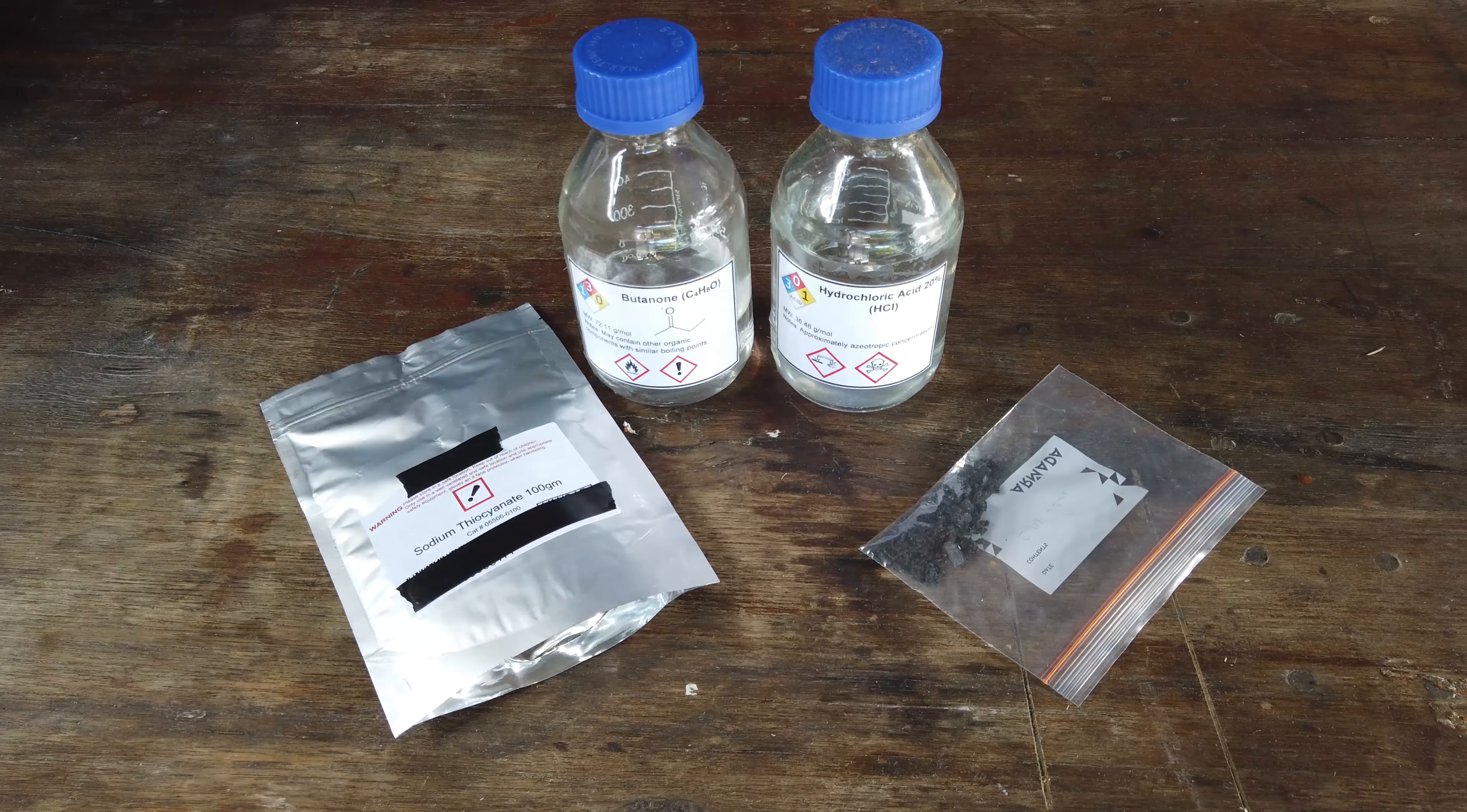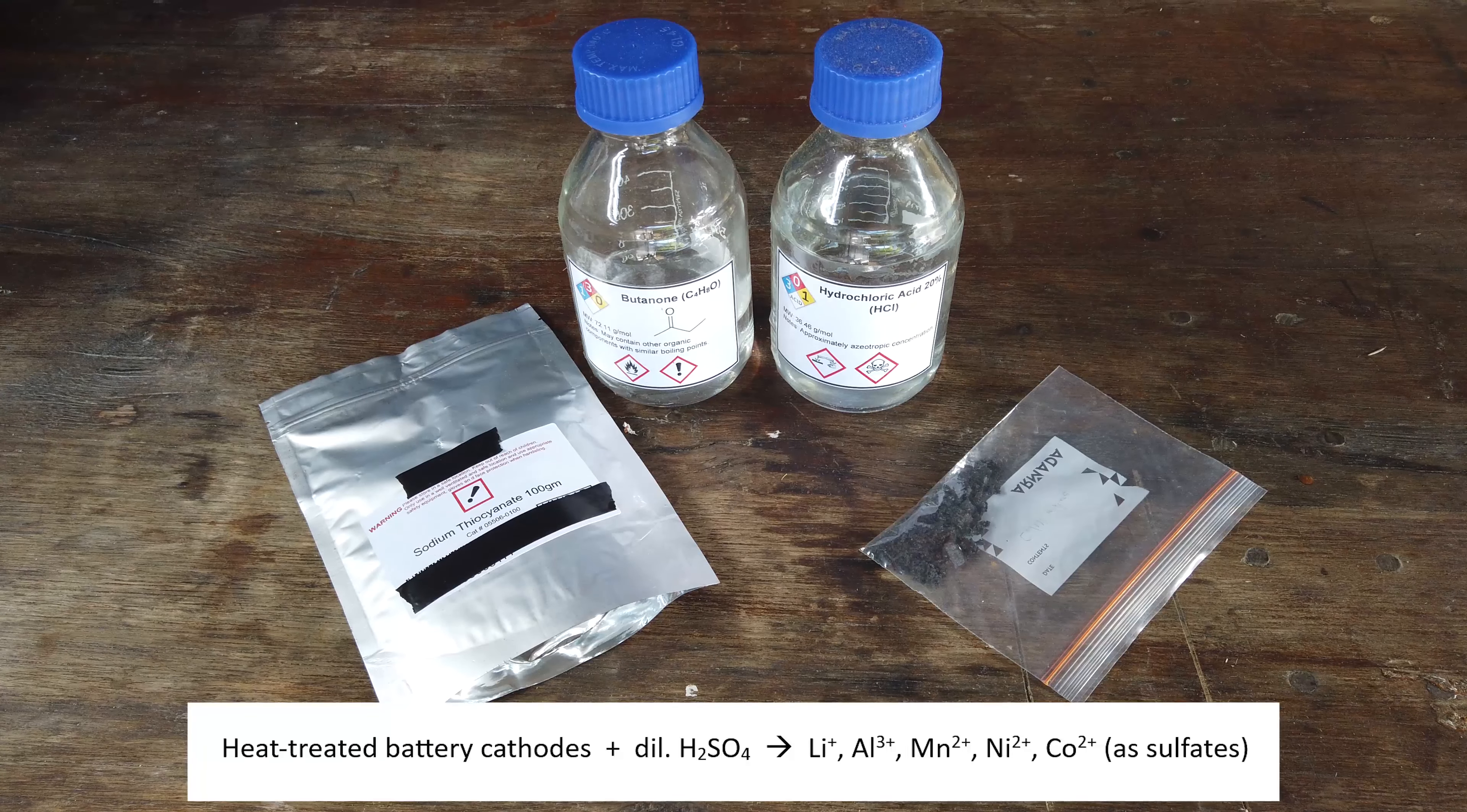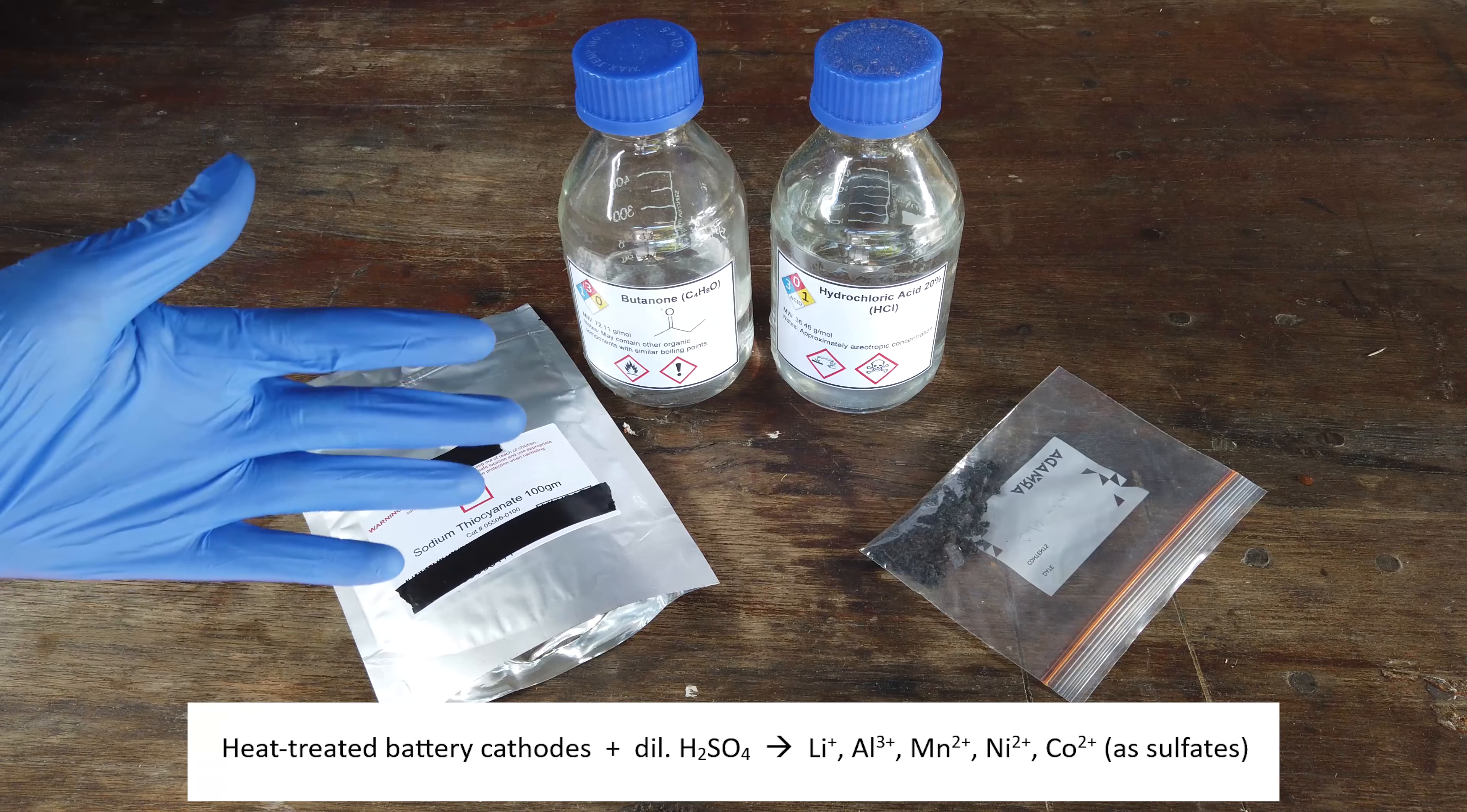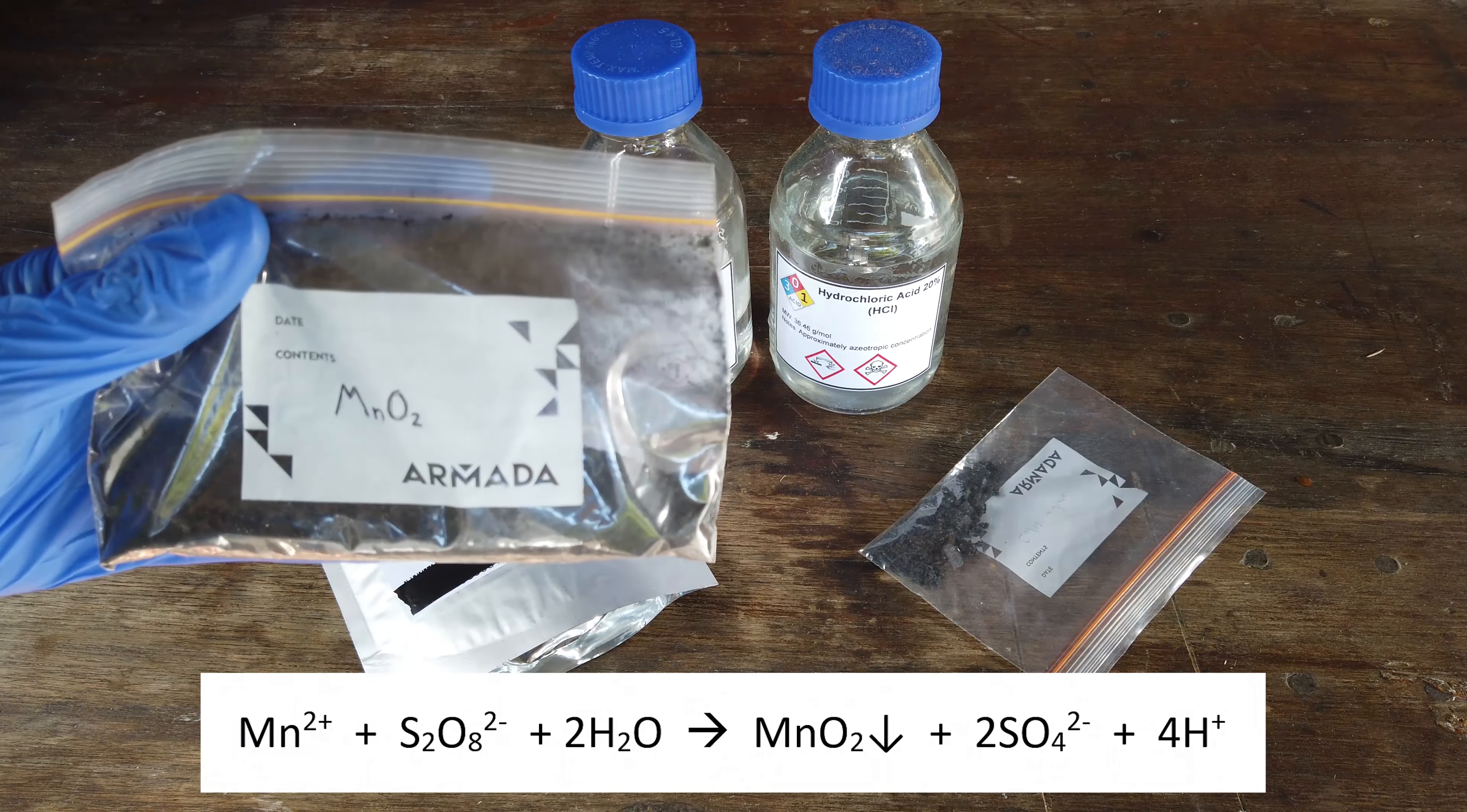Quick recap: we have painstakingly worked to dissolve up the electrode materials of around 160 watt-hours of lithium-ion battery. This gave us a big mess of a solution full of lithium, aluminum, nickel, cobalt, and manganese. We first separated out the manganese by oxidizing it to manganese dioxide, which we have purified and extracted here.